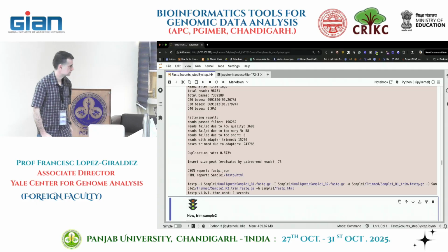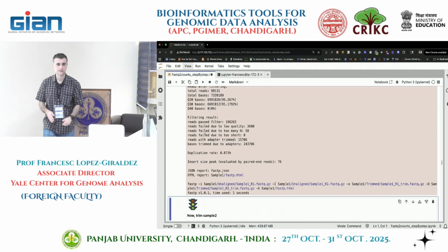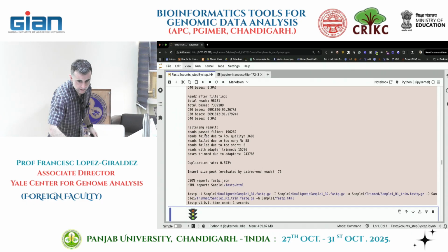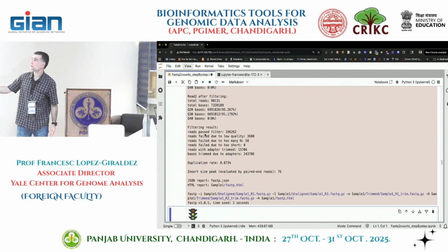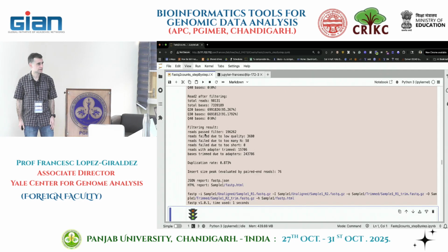So here is the Q20 basic. If we set the cutoff at Q20, you know how many you remove. So it's giving us options, right? It gives you a report that tells you how many bases are Q20 and above. So you have 95% that are Q20 and higher, Q30 is 91% and higher, and there are 0 that are Q40. So you have 4 point something percent that are below 20. Those are probably the bad bases.